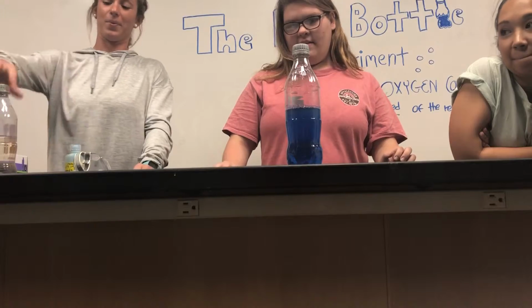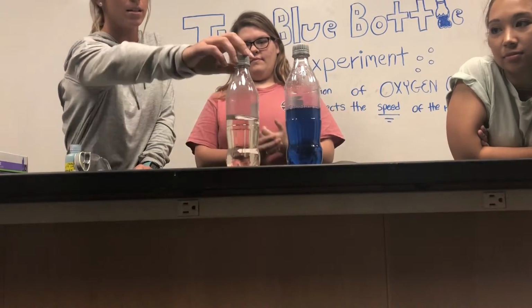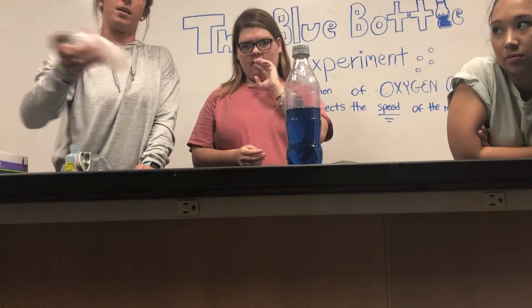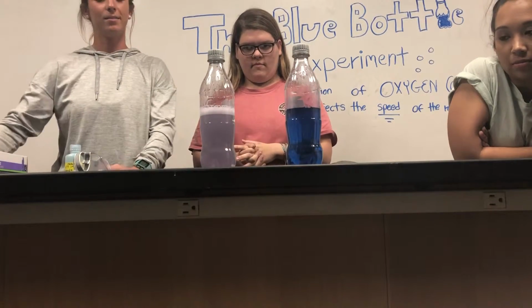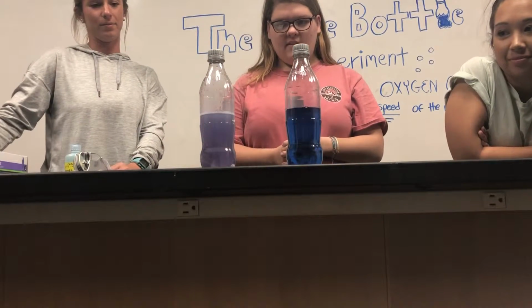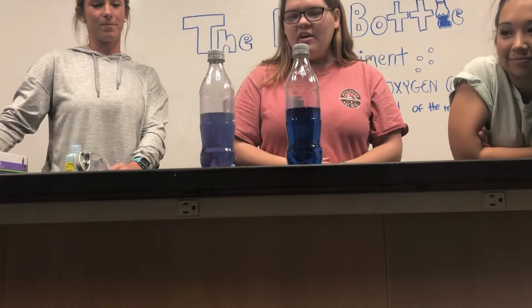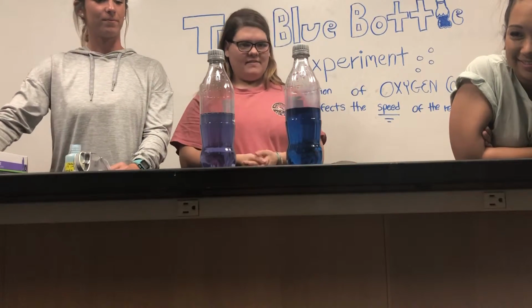So while we're looking at this one, we can take a look at our old one that we have. See how it has discoloration. It's not clear anymore, just from overuse. So we can just kind of see how much longer this one takes to turn blue and go back to clear again. See, you can tell the difference in that one too. It's kind of a more light purple color. It used to be the same color as this one, but.